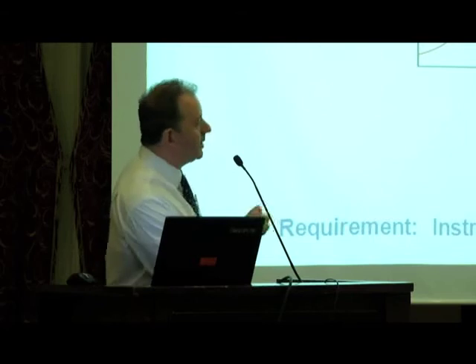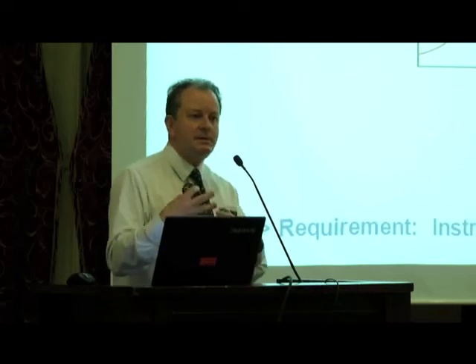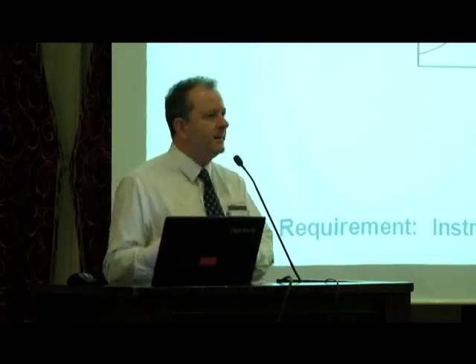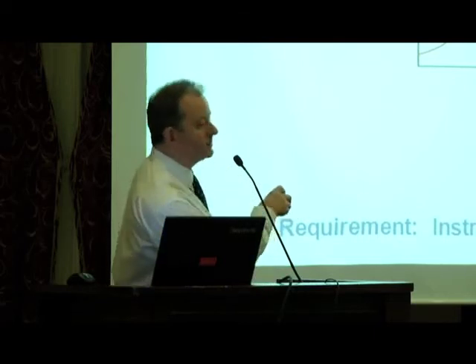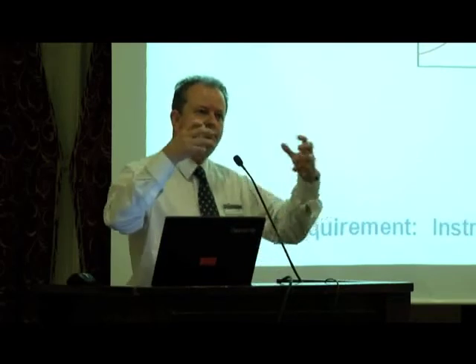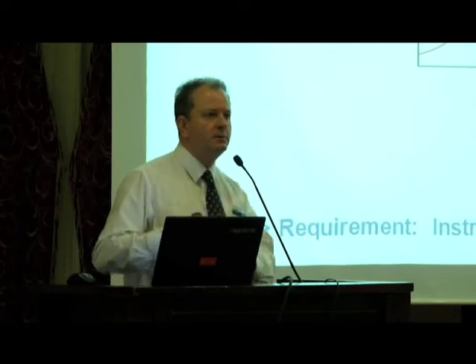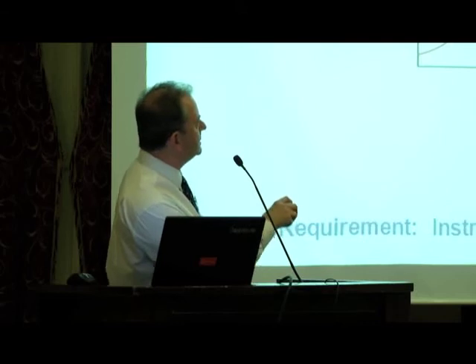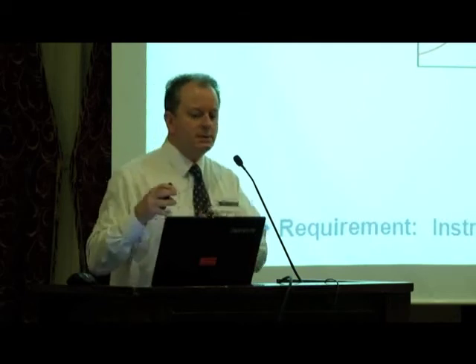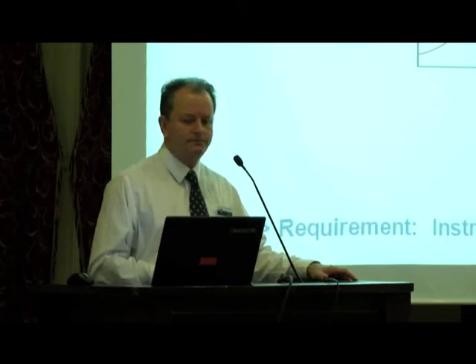So sometimes when you're breaking these organic materials down, they break into an intermediate species, like an organic acid or something like that. This organic acid contributes very strongly to the conductivity. But then as it's broken down to carbon dioxide, the carbon dioxide does not contribute to conductivity as strongly. So you see this pattern as it goes to the intermediates in the organic acids, and then it breaks down to carbon dioxide. So it's very important to complete that analysis, otherwise you will get a wrong result.